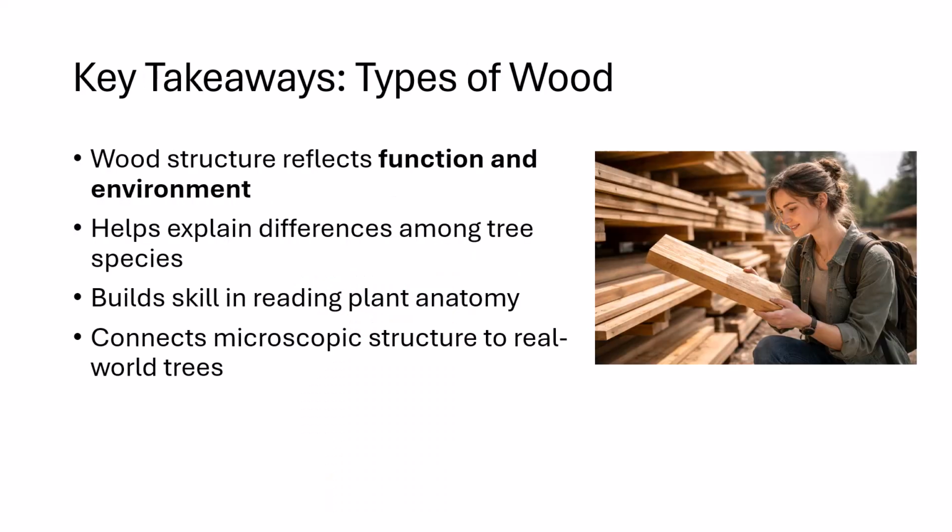This activity shows you that wood is not the same in all trees. Its structure reflects both function and environment. Being able to recognize these patterns helps you understand how different trees move water, grow, and survive in different conditions. It also strengthens your ability to interpret real plant anatomy from microscope images.